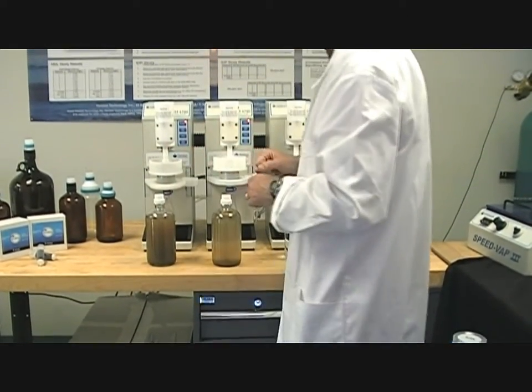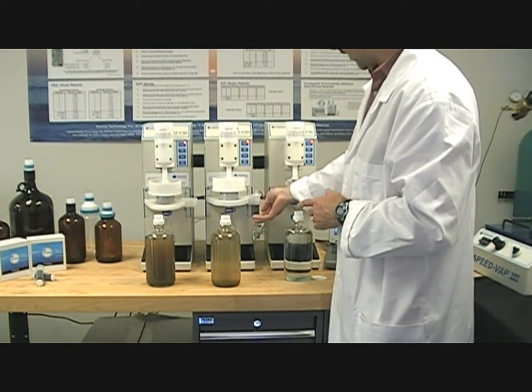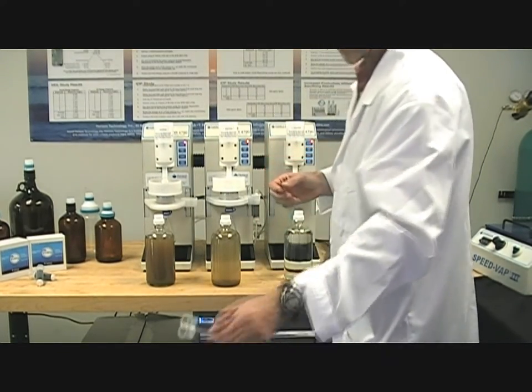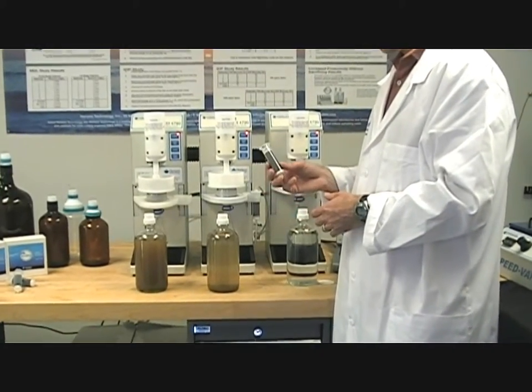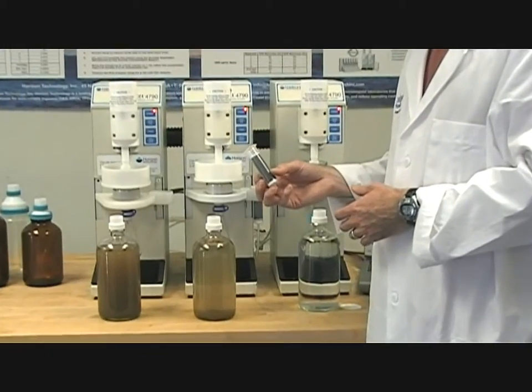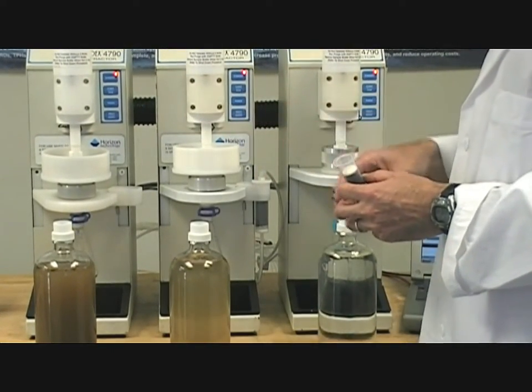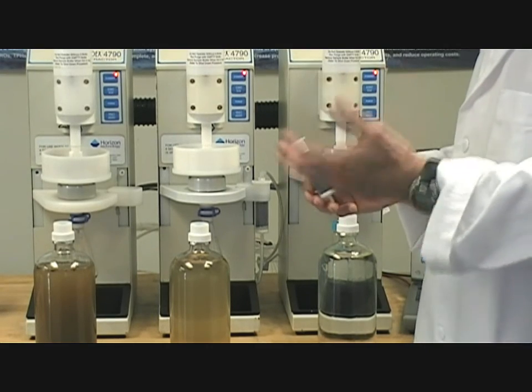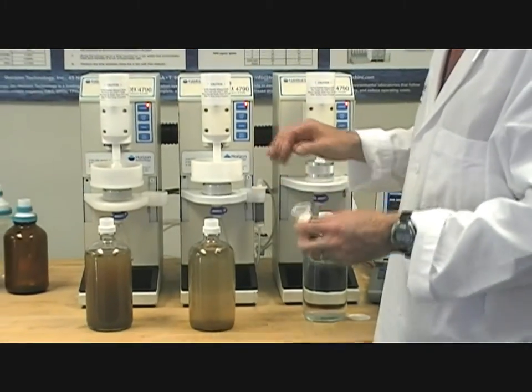You'll also see one of these machines — our instrument has a carbon cartridge configured. These carbon cartridges are used, in some cases, to extract light-end semi-volatile organic compounds — those analytes that aren't retained on the disk, that are light compounds. We can capture those using our carbon cartridge. This is an optional accessory.